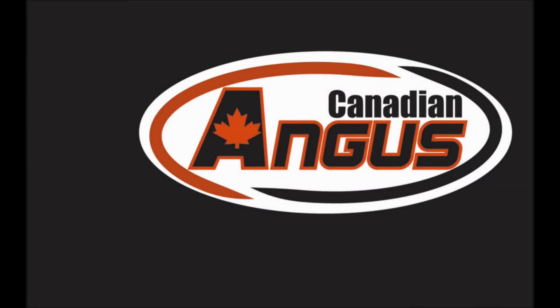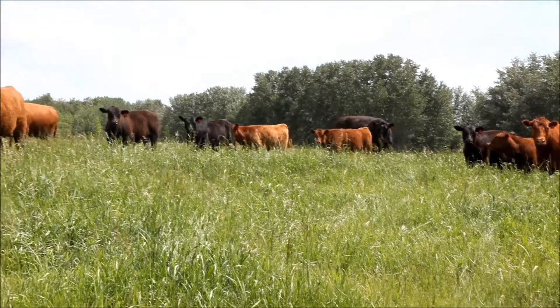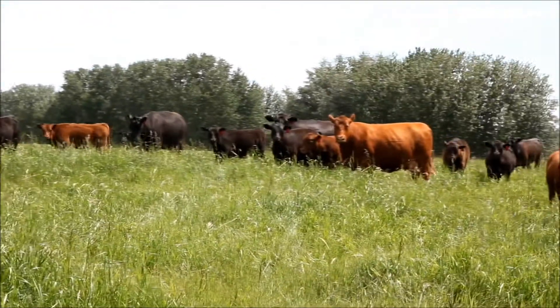Welcome to DNA Collecting! Today we are going to learn some techniques and helpful hints about how to collect DNA from beef cattle.